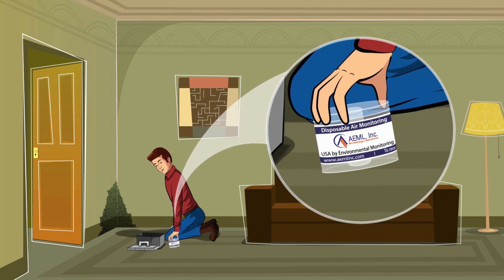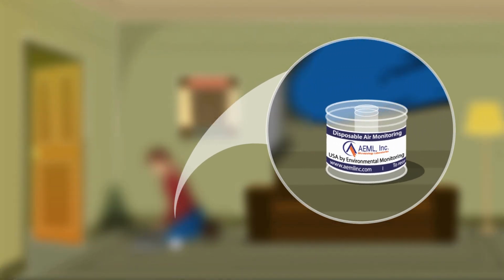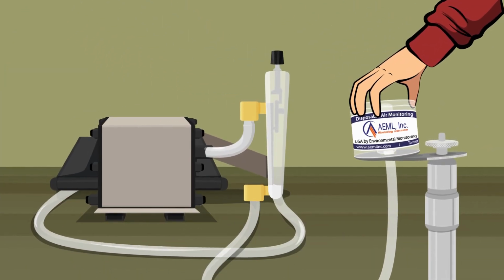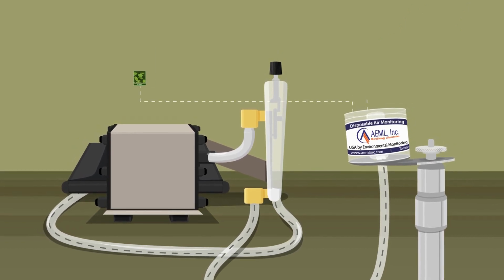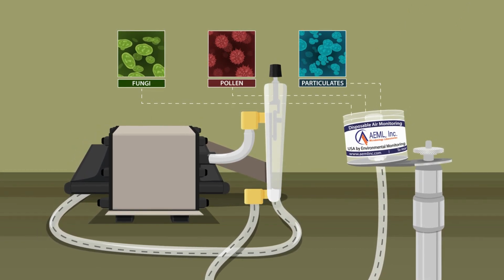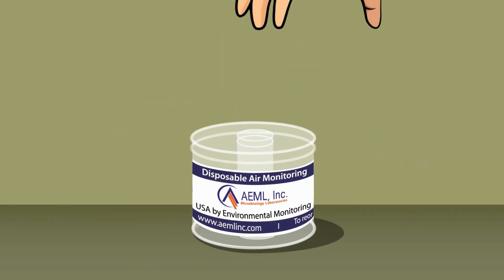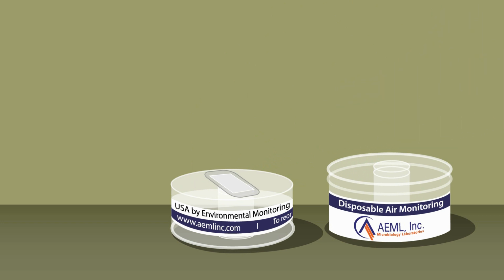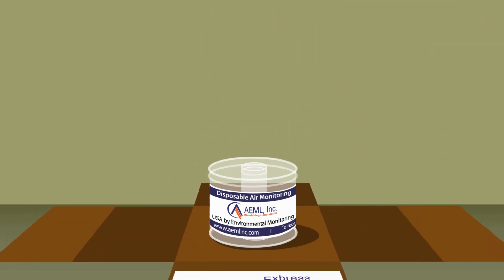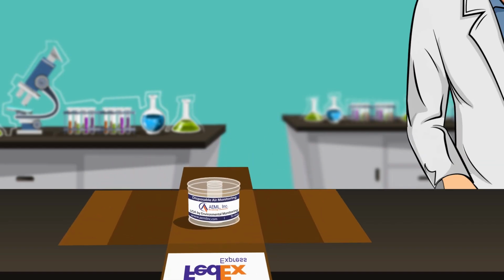specially designed cassette called a spore trap. Spore traps work by drawing in air to collect airborne bioaerosols including fungi, pollen, and particulates. As the air is drawn in, any airborne bioaerosols present are impacted onto a sticky glass slide inside the plastic cassette. This forms a pattern on the slide referred to as the trace. The samples are then shipped to the lab for analysis.